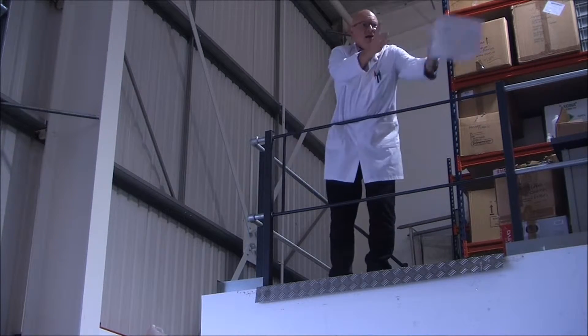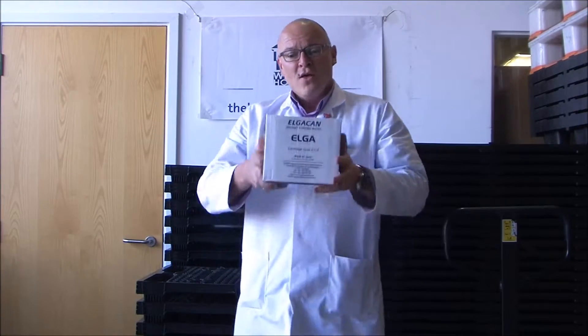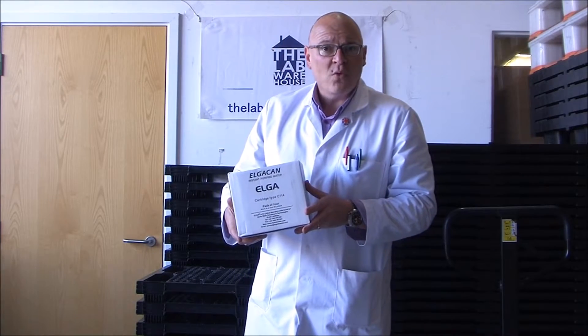Catch, Lab Warehouse Man. Thanks, Lab Warehouse Man. These are Elga C114 cartridges for the Elga B114 deioniser.